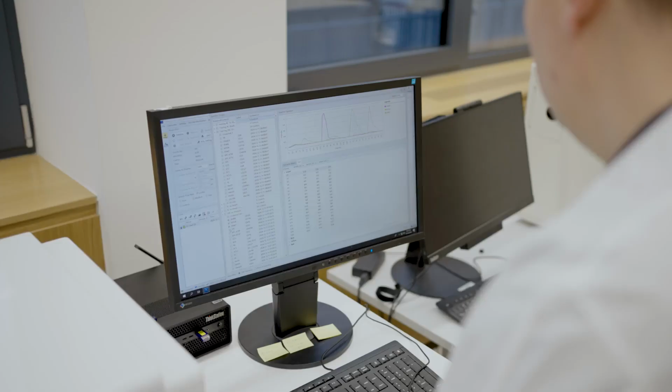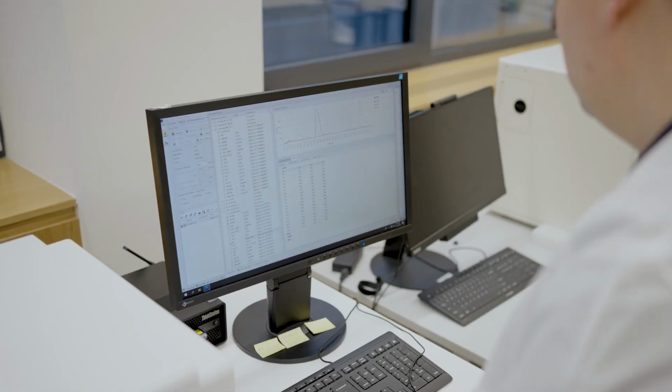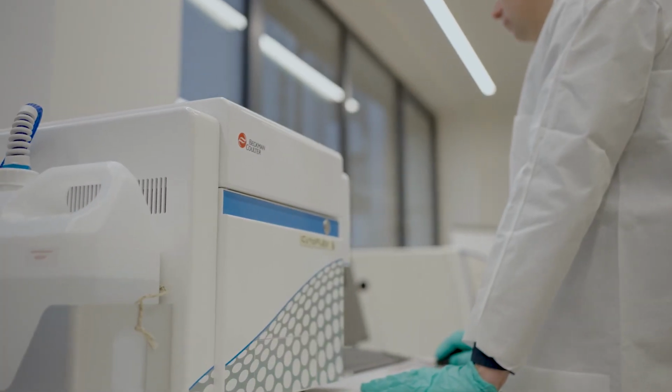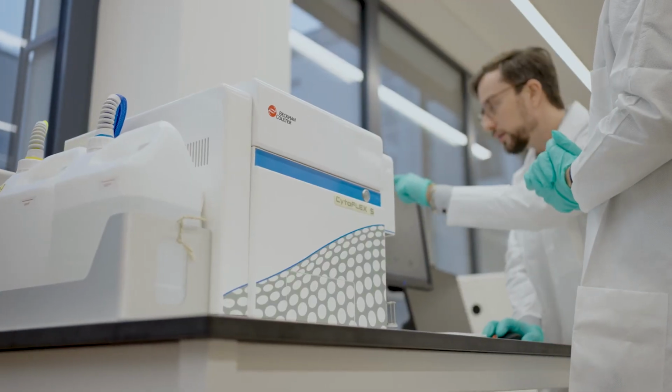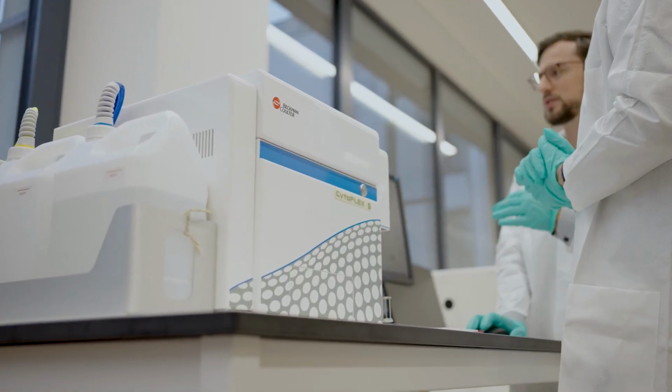I've run samples stained with highly similar dyes such as Alexa 647 and APC, FITC and BB515, and these are fluorochromes that normally cannot be separated on a conventional instrument, but they unmix very well on the Mosaic. In addition, I tested a combination of BV421 and Super Bright 436, which don't even unmix well on some spectral cytometers, but again, they unmix perfectly fine on the Mosaic.